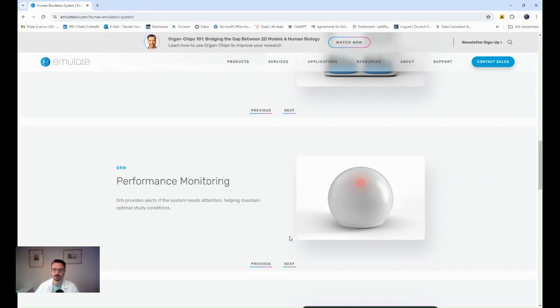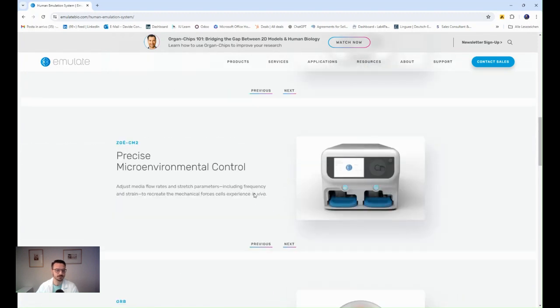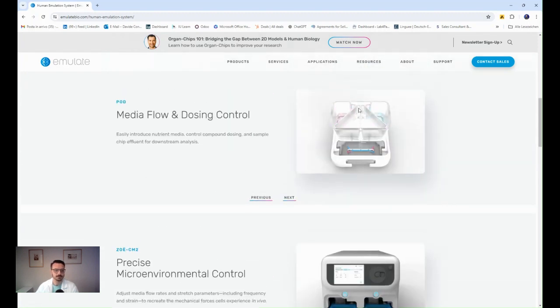In terms of microfluidic design, this is really simple, really easy to operate. It's basically just 2 channels. You don't have that much flexibility compared to the others, but you have really good control of the fluidic dynamics, and so this is also quite optimal. You have good reservoirs that you can use for sampling, for other kinds of design, so it's a good 5 also in this case.